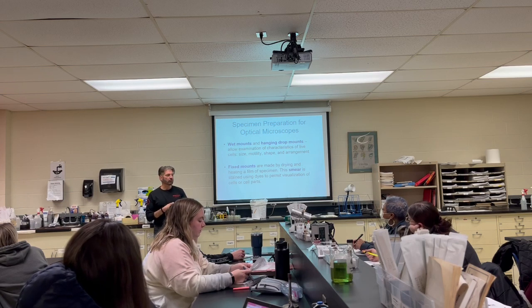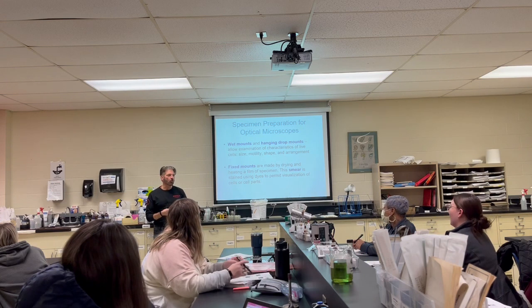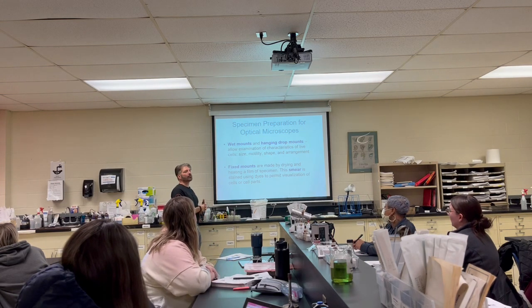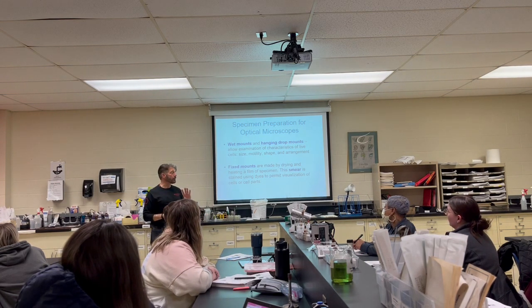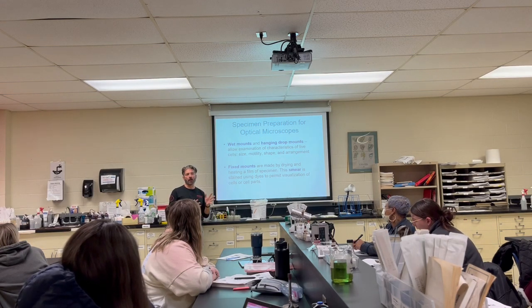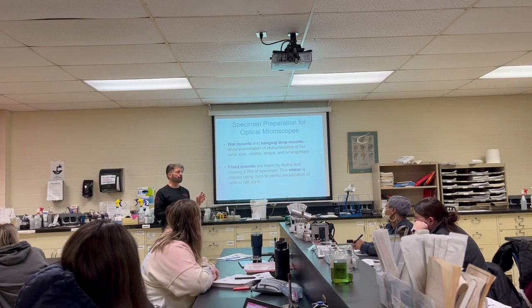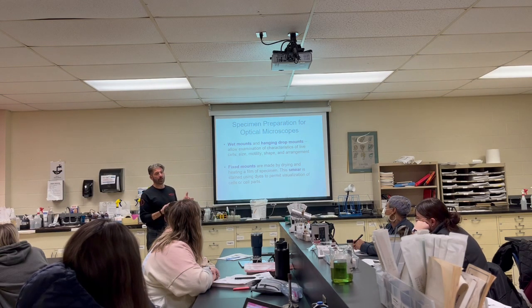I was ready for a drink because I couldn't even find anything on there. So today we're going to stain with a simple stain, which means we just stain it blue or pink or purple. Next week, we're going to gram stain and differentiate between gram positive and gram negative. I'll go over that today, time permitting, so you know what that is. That's really going to help you determine the structure of the bacteria.